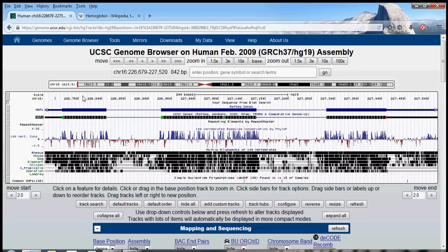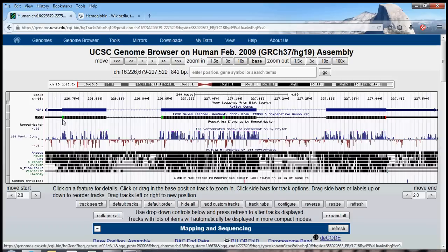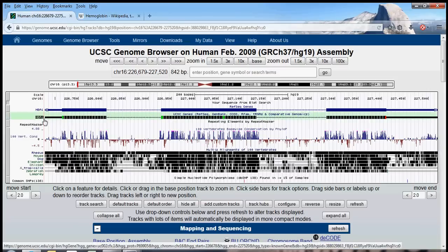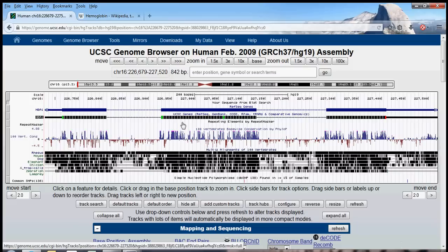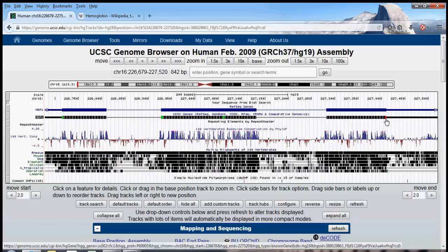Now, you'll notice that before the first exon, which the start codon for that exon is indicated with this green box, we have the 5' UTR, untranslated region is UTR. And after the stop codon, in red, in the last exon, we have the 3' UTR, another untranslated region.